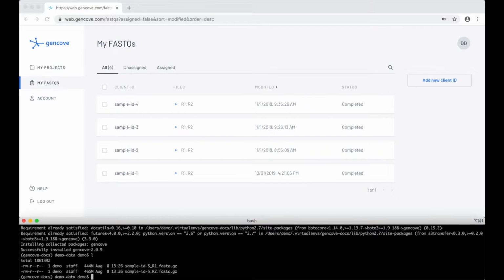If you have reads spread across multiple files, from multiple sequencing lanes, for example, they need to be merged into one R1 file and one R2 file. Luckily, gzip files can be easily merged without decompressing, so it's simply a matter of concatenating the compressed files. Following these simple conventions makes data ingestion very easy, and we highly recommend maintaining a consistent file naming scheme.